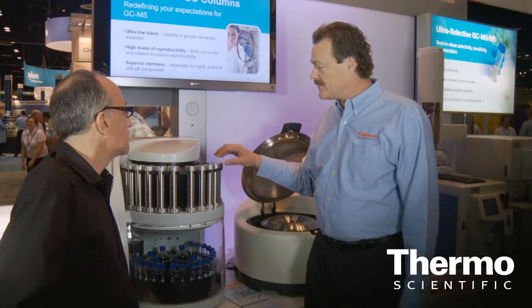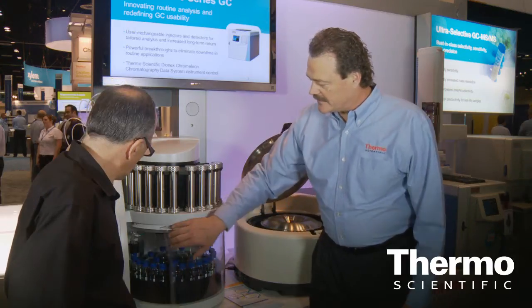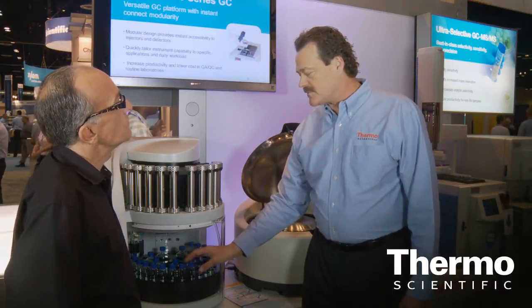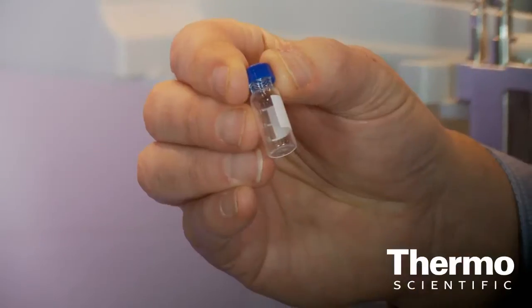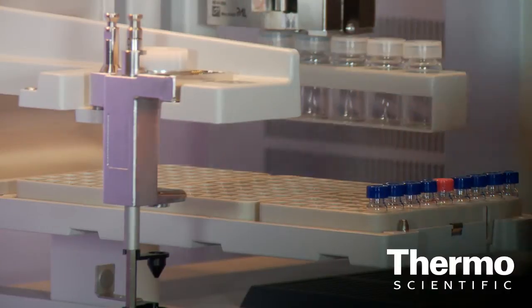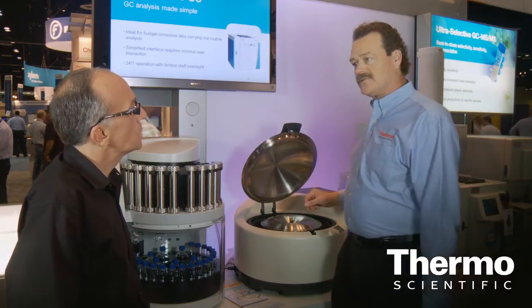This automated system also can be left unattended and run overnight without anyone being in the laboratory, which increases our productivity because it's preparing samples while doing other things. Once we have an extract, the liquid extract is collected down in this region, and then we can take those extracts. We have specially configured collection vessels which allow us to collect the sample and transfer them directly into an evaporation apparatus, where they're evaporated directly into auto-sampler vials which then can be loaded in a chromatographic system. The sample itself is placed in the cell by the user and from then on there's very little interaction with the sample itself.